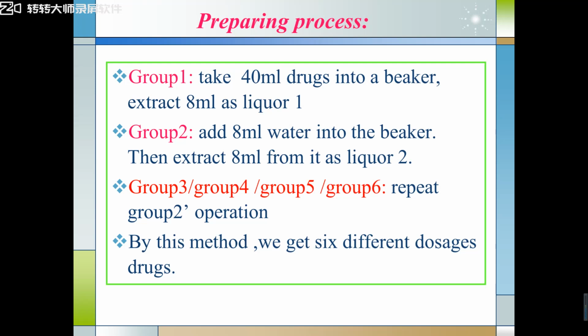Just now we know the total volume is 40 milliliter, and the first group of students extracted 8 milliliter. That means we only have 32 milliliter of drugs. The second group of students come here and add 8 milliliter of water.